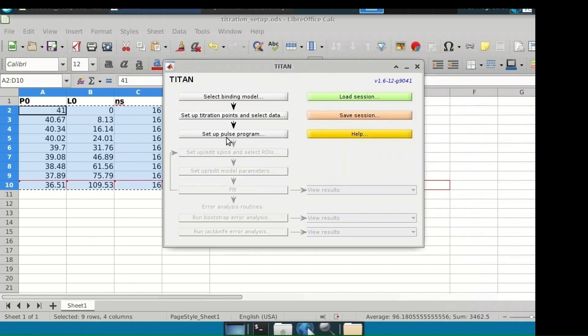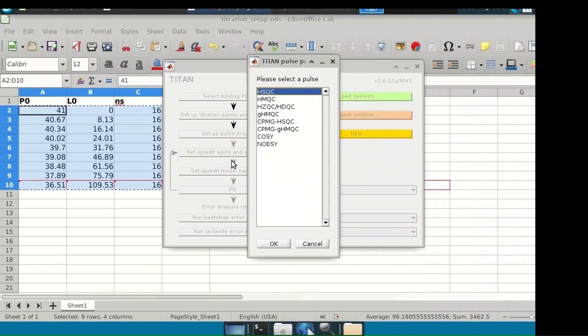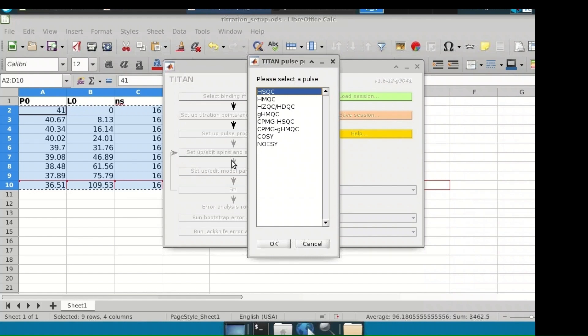Set up a pulse program for the virtual spectrometer. Many pulse sequences are available for analysis, however HSQC and HMQC are the most common. Make sure to pick the correct one as this will impact the line shapes in the indirect dimension. In this set of measurements, data was acquired using a 1H-15N HMQC experiment, so we will select HMQC.